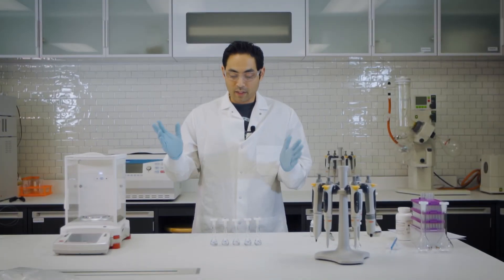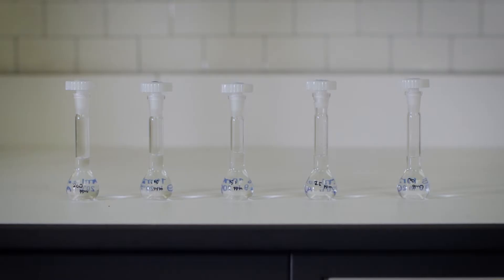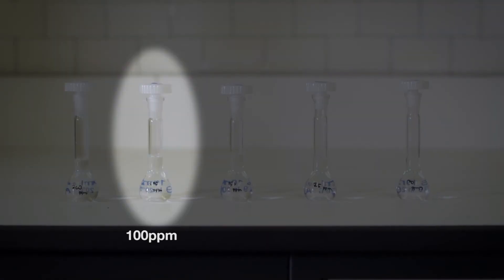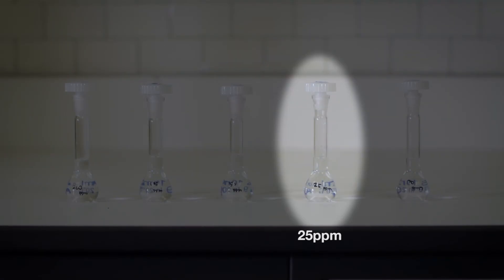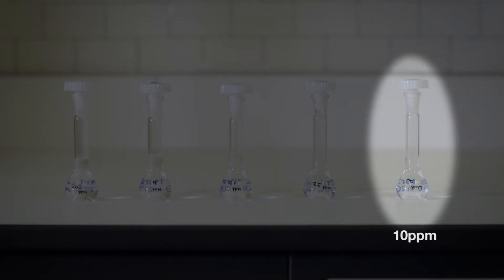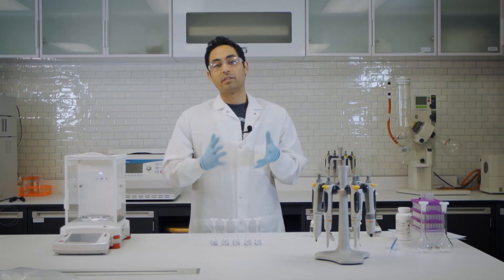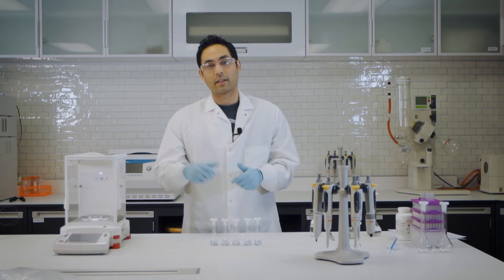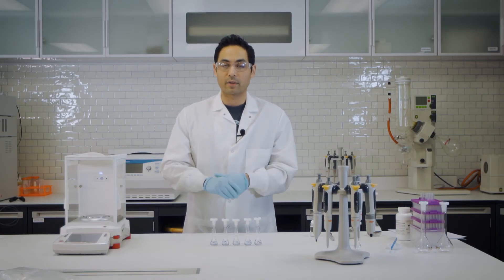Alright, so we finished the volumetric cal curve. I got my 200 ppm standard, 100 ppm standard, 50 ppm standard, 25 ppm standard, 10 ppm standard. So we're going to get all of this into vials and then we're going to inject it on the HPLC and then we'll see how we did.